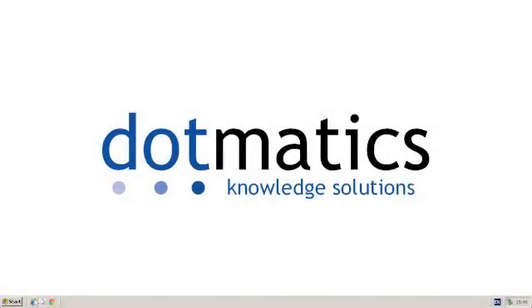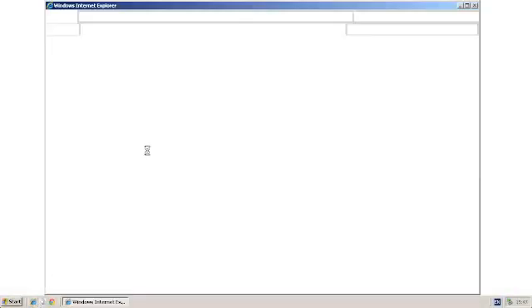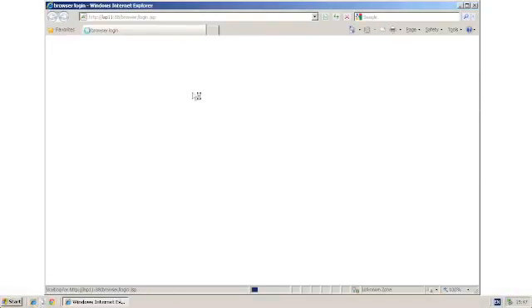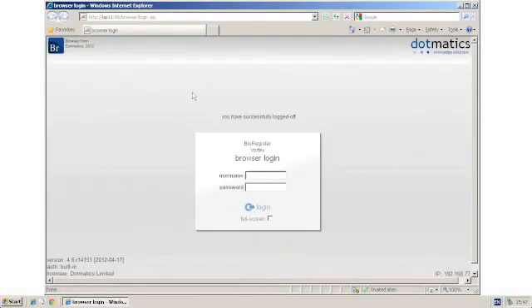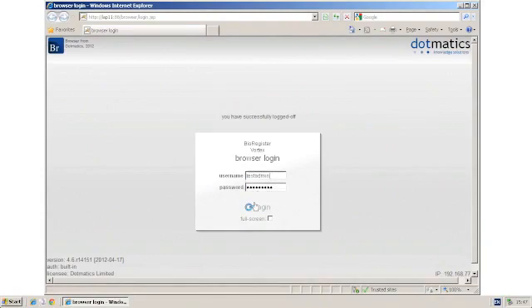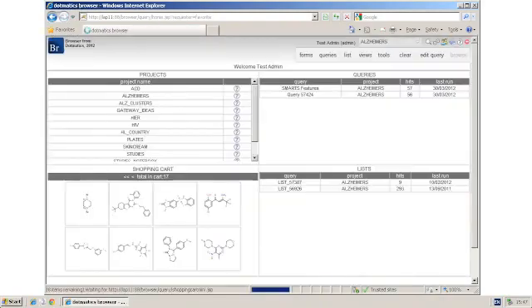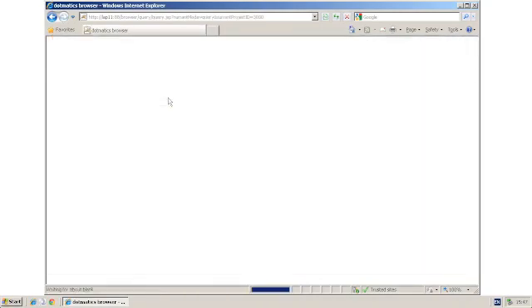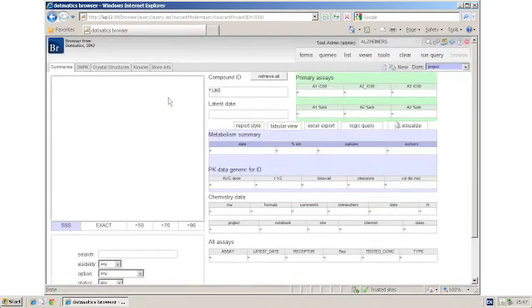Browser from Dotmatics is a web-based querying and reporting tool that allows us to query data stored in a database. Here's a browser form. On the form are many objects.